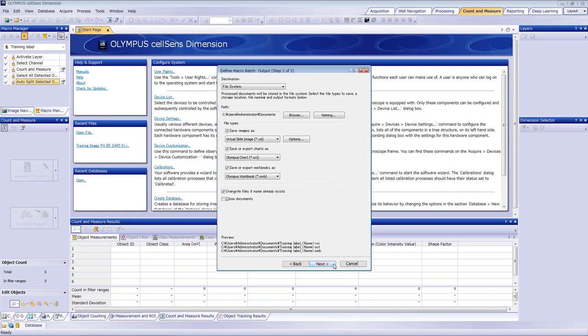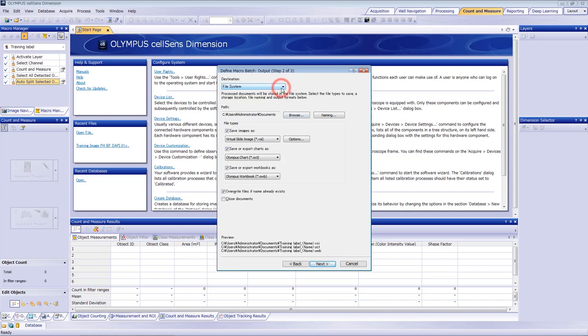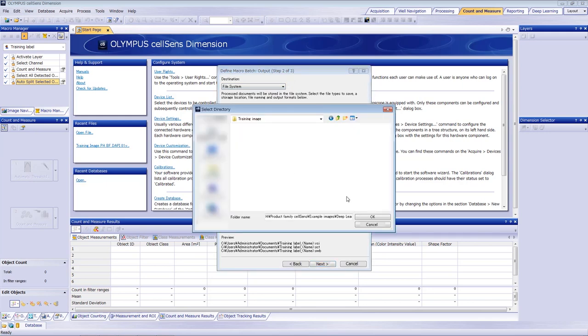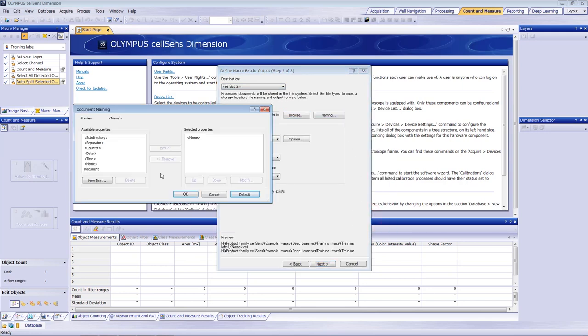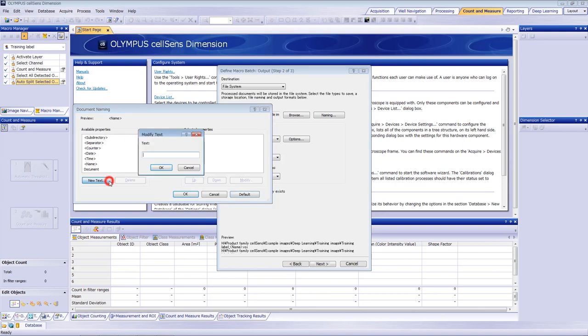Choose the location where you want to save the files. Here, we rename the batch Training Label.